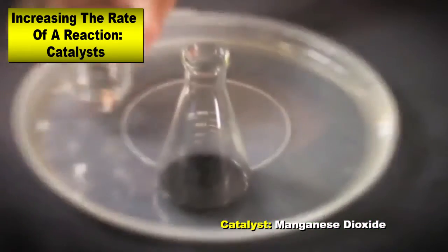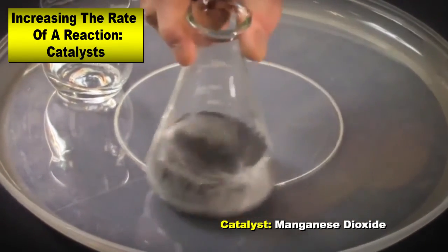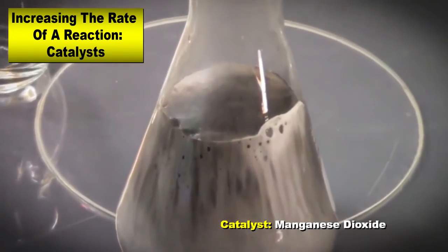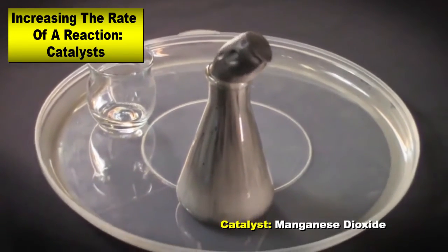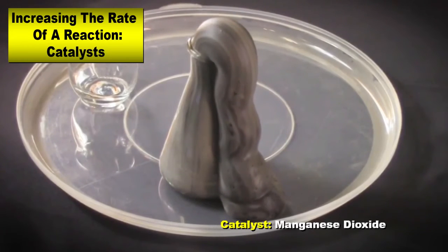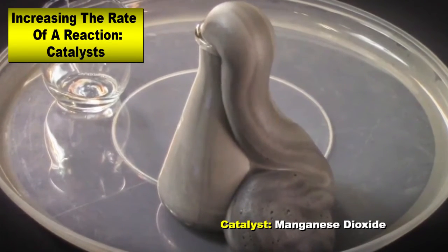So we're going to take our 12%, and we're going to pour it in and see what occurs. Now you'll notice they all have a certain look to them. You can see some fine bubbles in comparison when we're looking at the yeast, as well as when we looked at the one with the liver, we ended up seeing something that looked a lot more like this, where there were really, really big bubbles. And what's kind of fun is if you put your hand on the flask, which you can't do in TV land, you'd notice that this thing has definitely been heating up a little bit. But that looks kind of gassy. Look at this black stuff coming out. So this is a different catalyst, and so we'd mark this at a different position on the energy diagram.